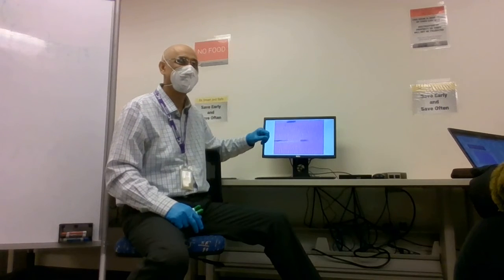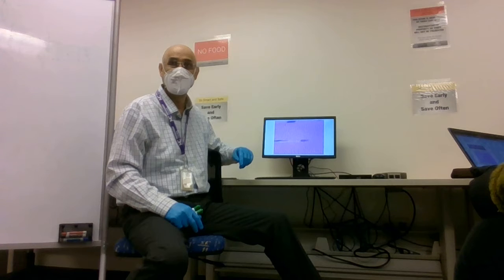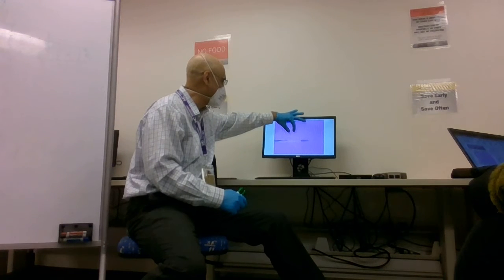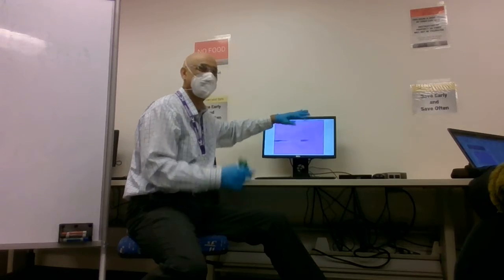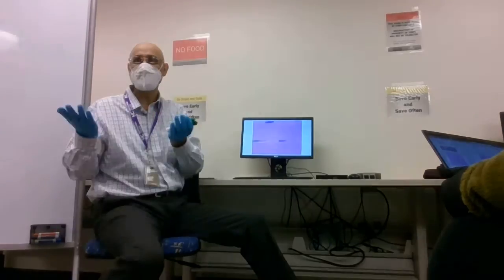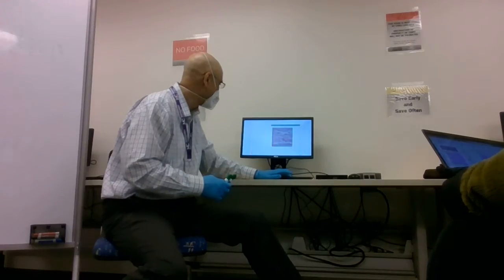And the light one is the I band. And within the I band, you see a dark pink line. That's the Z disc. And if it says, show with the help of a line, it shows with a bracket, what is the distance between these two structures? What will you say? Make sense? This is not bad. So you guys happy with this? Yes. You're awesome. This is easy stuff.